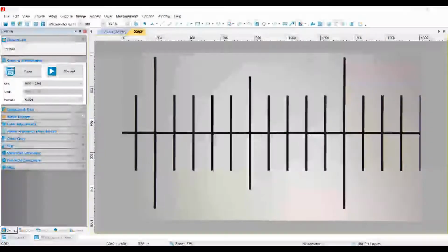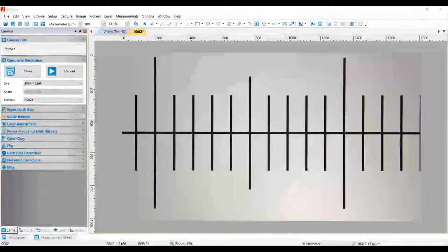This video serves as a quick overview of measurements in the InFocus software. The measurement tools can be accessed from one of two locations, either from the measurements drop down here, or via the measurement icons found in the central bar here. I will now give a quick rundown of each of the tools available, starting with the angle tool.